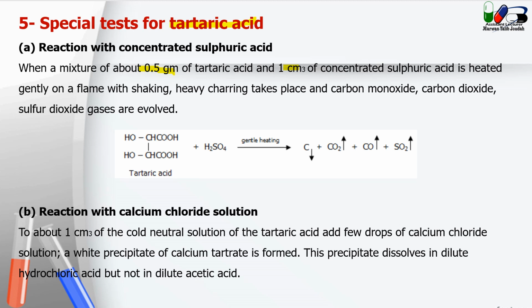So for this test, we will not be able to distinguish which gases have been evolved. However, we will just be monitoring, and when the gases, no matter what they are, evolve, then we're good to go, and that's it. The reaction has been completed.